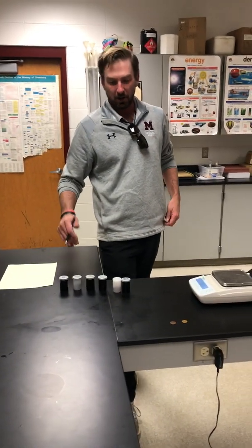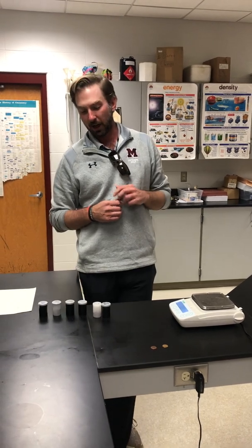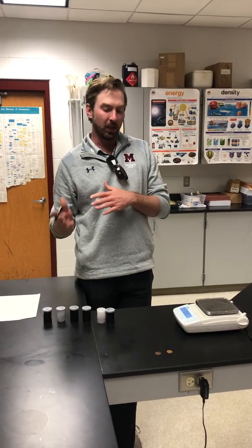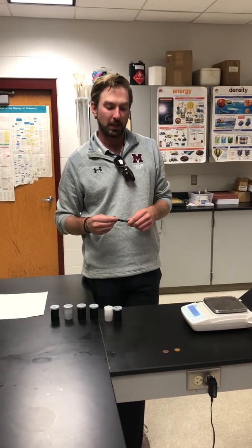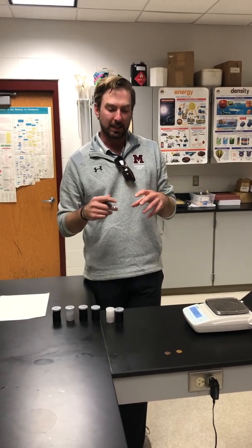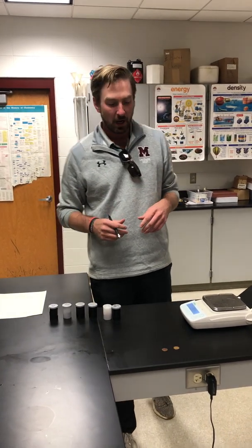Go. All right, class. Today we're going to be looking at isotopic pennies for the lab. Pre-1982 pennies were made of just copper, and post-1982 pennies have zinc inside because copper started to become more expensive than what the penny was worth.